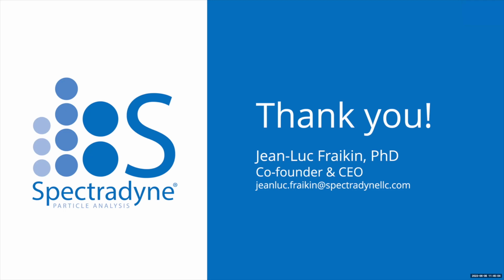And then I also see one here from Dennis. Hi, Dennis. Does the instrument require high ionic strength and addition of Tween in the diluent for particle detection and characterization? We have had issues with the compatibility of Tween with LNP stability.